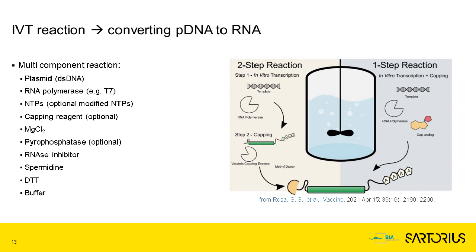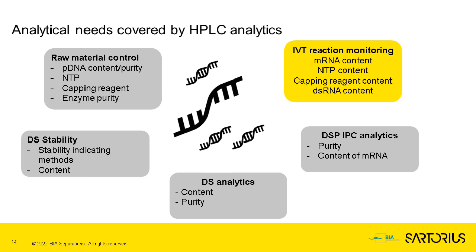So DOE is probably going to be the workhorse from the theoretical perspective. What about from the measurement perspective? What's the best measuring tool that we can apply here? And it is very much our view that what's important as a readout in the reaction is the concentration of mRNA, of course, as the measure of productivity, but also the concentration of nucleotides.